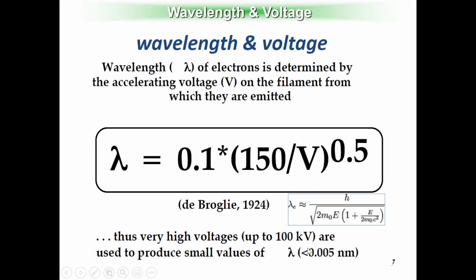The microscope I used previously at Oak Ridge National Lab is a 200 kV, and some of the centers have 300 kV. But even if we use, say, 60 kV, a smaller accelerating voltage, then you have to consider other hardware to improve the resolution, not the wavelengths of the source itself.